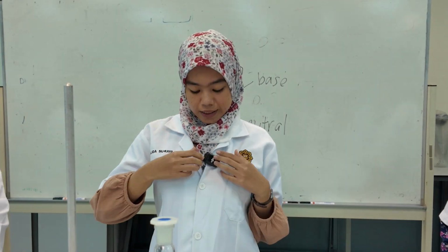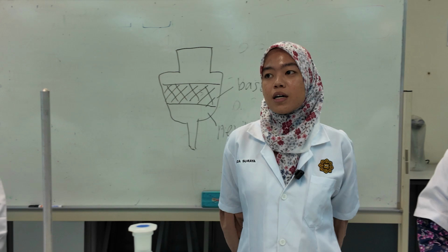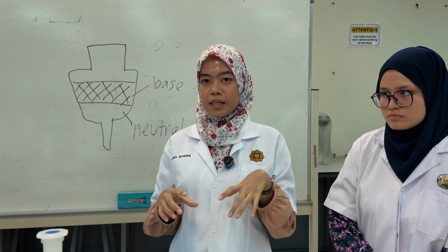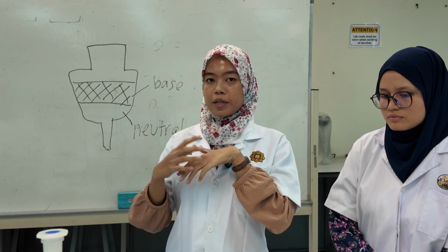Okay, now I will present the last part, which is the principle and the application in the industries. The liquid extraction principle is widely applied in industries such as petroleum, chemical, pharmaceutical, and food. In the lab, we use separatory flasks, and the most important part is we have to use a chemical or organic solvent, such as dichloromethane.